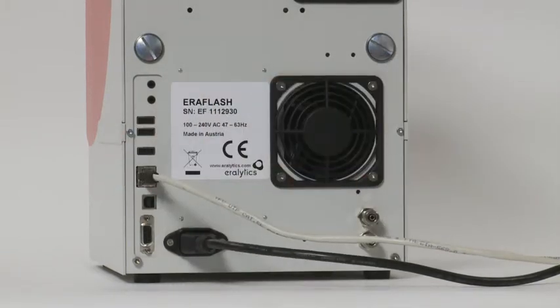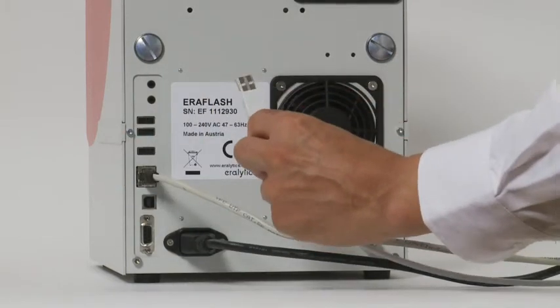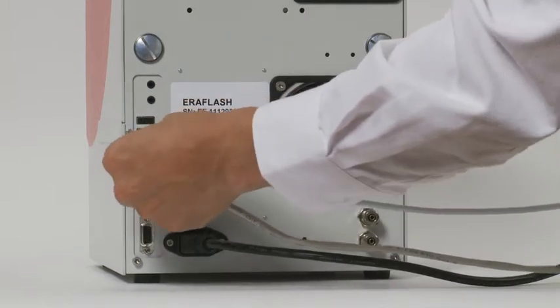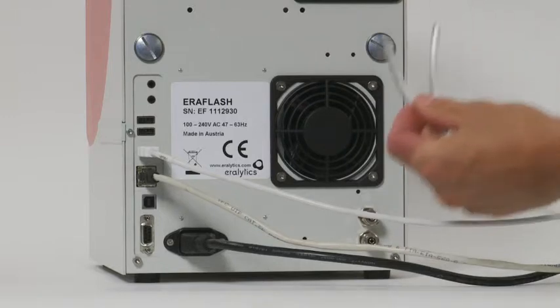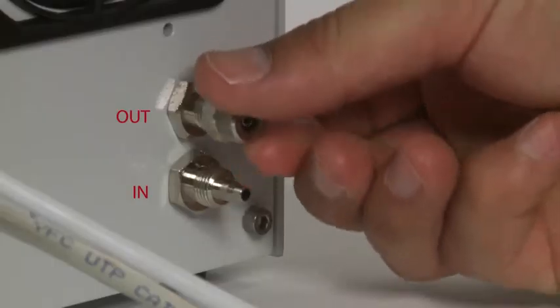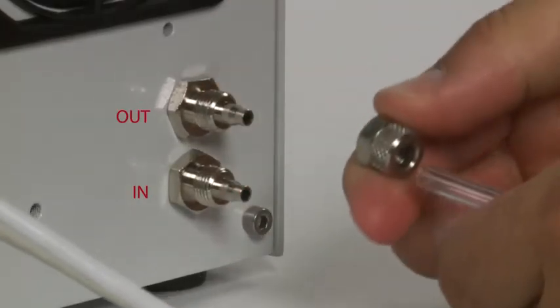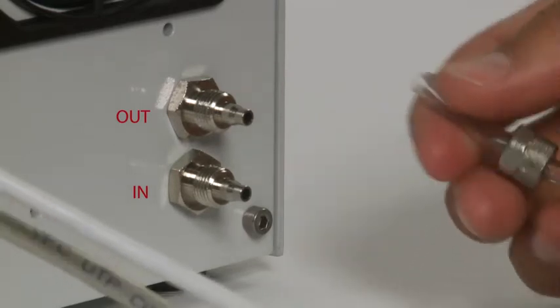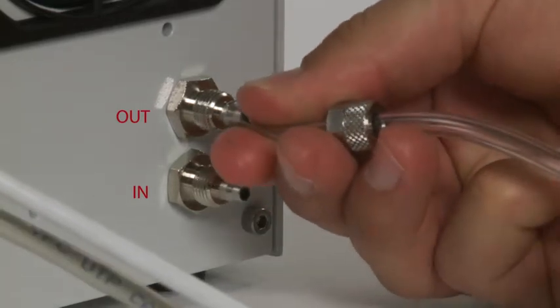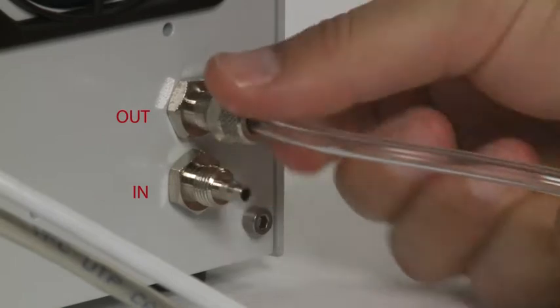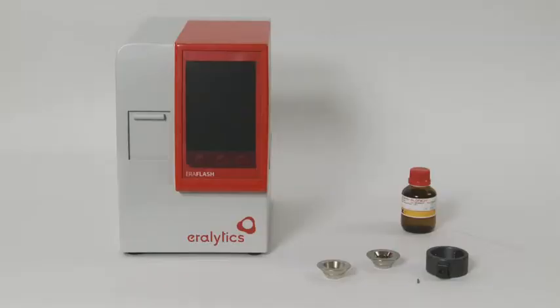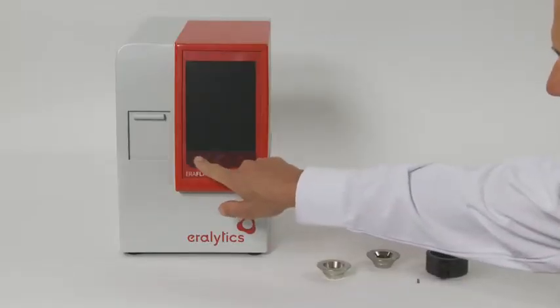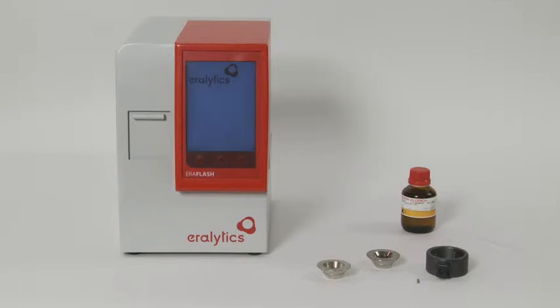For data transfer or remote control, the unit can be connected to a network by the Ethernet interface or directly to a computer or printer using the USB ports. For measurements below zero degrees Celsius, connect the Eralytics Flash to an external cooling device. The upper connector is for coolant out and the lower connector for coolant in.